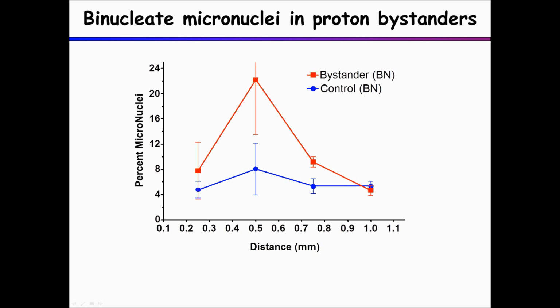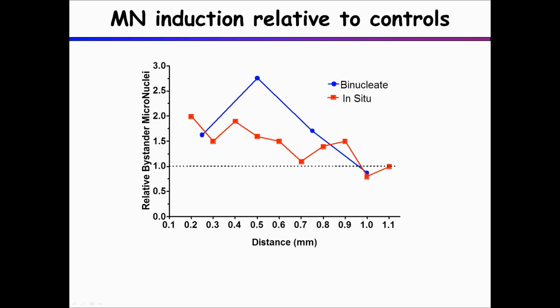But if we look at these also now, just comparing the data from those two, with the controls bouncing around and everything, the control levels were actually quite different using the two techniques. So this is just a comparison of the two different ways of measuring micronuclei, which were done several years apart. If we normalize them to the controls in the assay model that we're using, you can see that the results now actually look like they're tracking not so badly. They show that same sort of elevation.